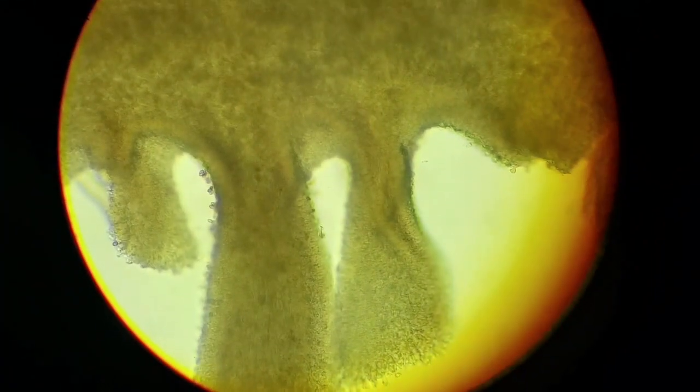Okay, so this is one of the sections that I said is no good. And the reason why I know it's no good is, I mean, I have the top, right? I have the top of the cap. But if you look at the gills, they're fine in the very beginning, but as you start to go down, they've already twisted themselves onto the finer surface, onto the surface with the most area, which is unfortunately the side. So this means that this is way too thick. And also the bottom of the gills have been severed off in my sectionings.